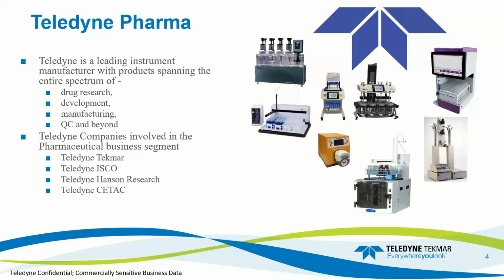What you see over here on the right-hand side of the screen, if you follow my pointer, is a whole host of instrumentation or systems that we use throughout that process of research, development, QC, manufacturing. So what we might see here is a dissolution system, some automation systems, flash chromatography, also the TOC analyzer, which we'll be talking about more today.